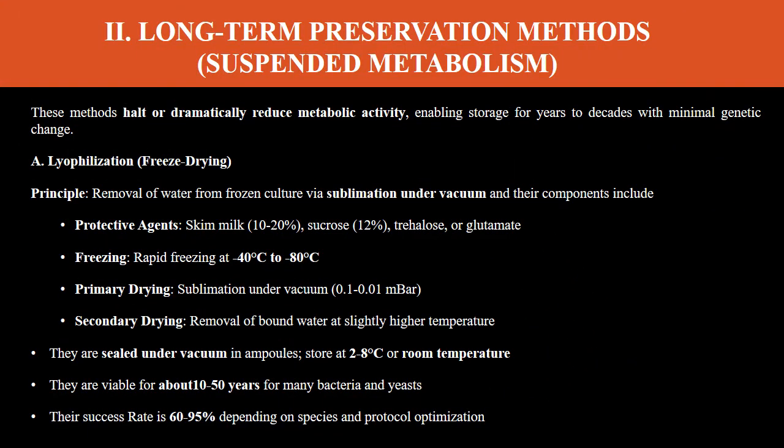The second method is long-term preservation method, which is a suspended metabolic activity. These methods halt or dramatically reduce the metabolic activity, enabling storage for years to decades with minimal genetic change. The first one is lyophilization, which is also called freeze drying.